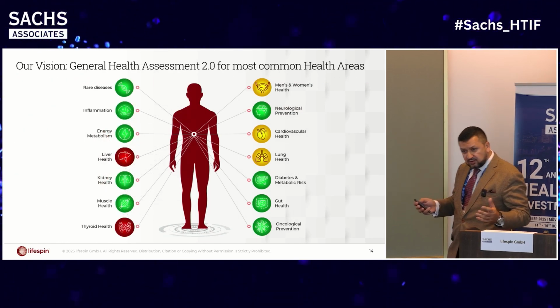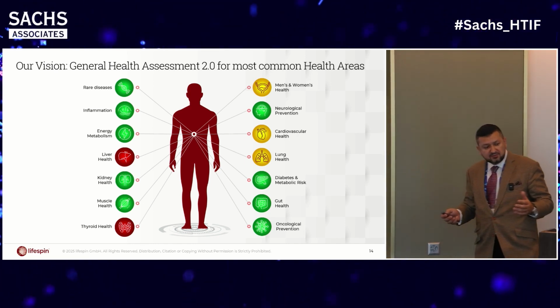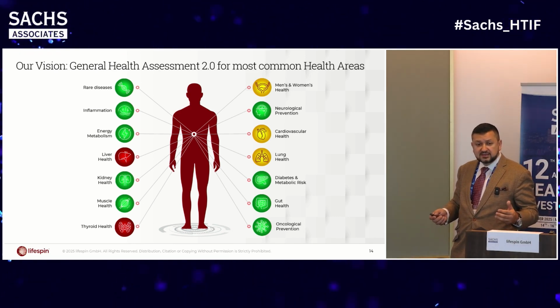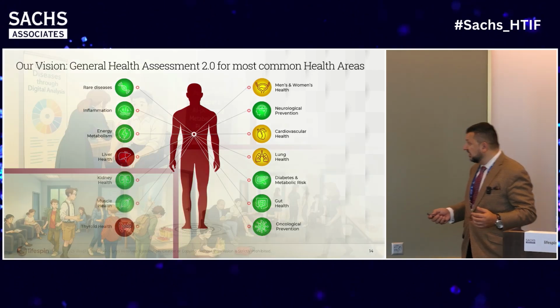Our vision, our North Star, is basically to expand our software platform so that it can recognize the most common health areas and can annotate the metabolites and the metabolic parameters accordingly.